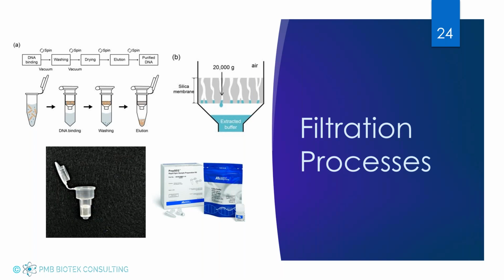A lot of these method developers don't have the ability to get cannabis that has high levels of THC on site at their facility. Because if they bring hemp into their facility to do some R&D work with it, and it ends up being tested and having high concentrations of THC, they can have legal ramifications for that. So they don't bring any of this product in. So they're really looking to laboratories to do some of this additional R&D work within their internal method validations.